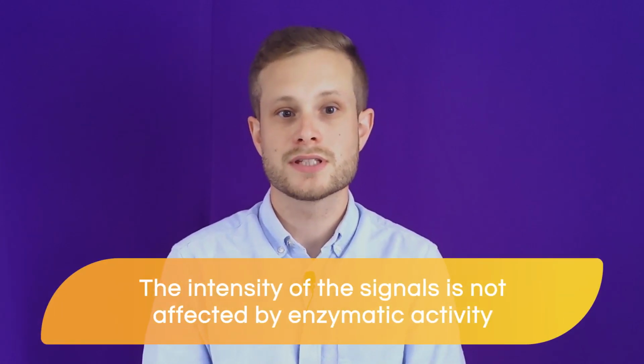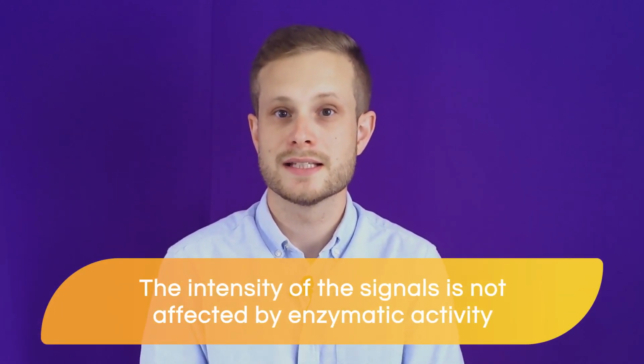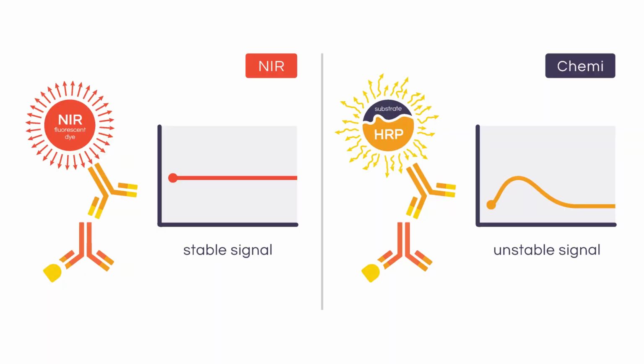Let's now talk a bit about dyes. The main advantage for using these for detection, as opposed to enzymes which you would use in chemiluminescent detection, is that the intensity of the signals is not affected by enzymatic activity, and therefore they will be stable, in stark contrast to the dynamic signals which are produced by an enzymatic reaction.